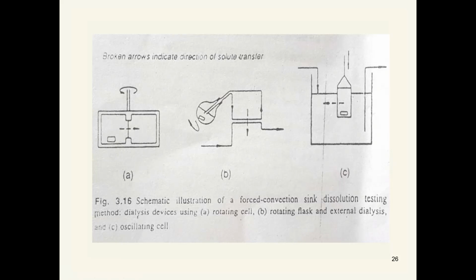In the dialysis method, selection of the membrane is important. In every apparatus there is one important thing. Selection of the membrane is very, very important.